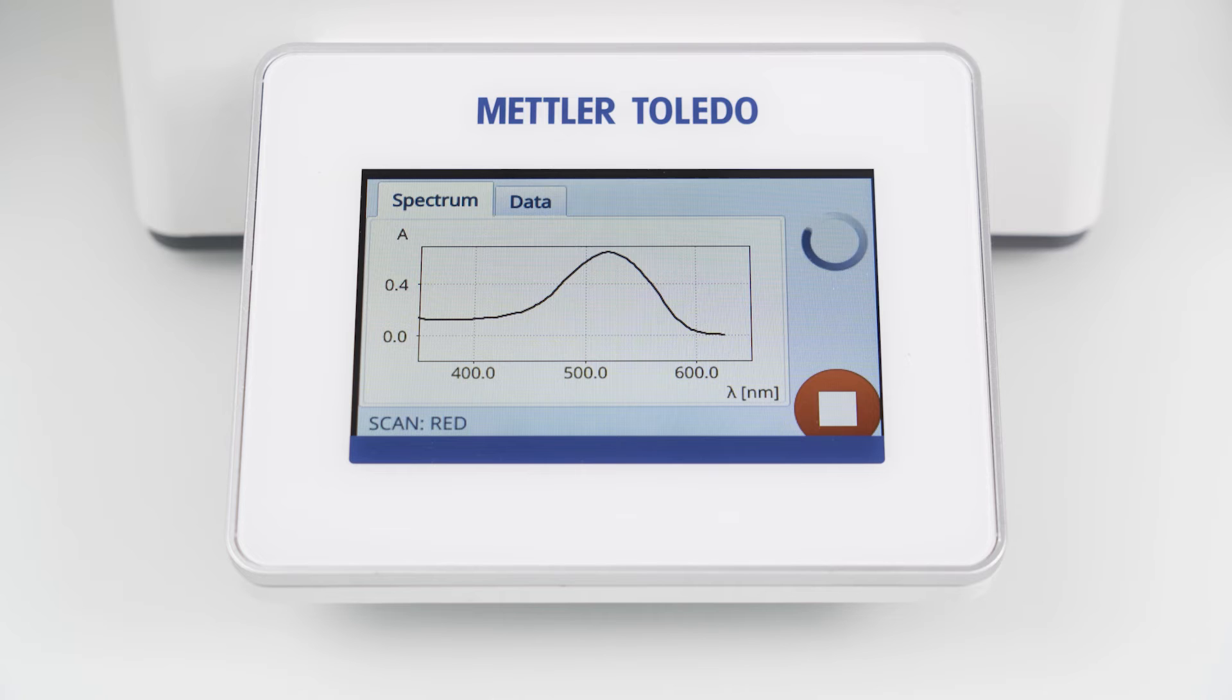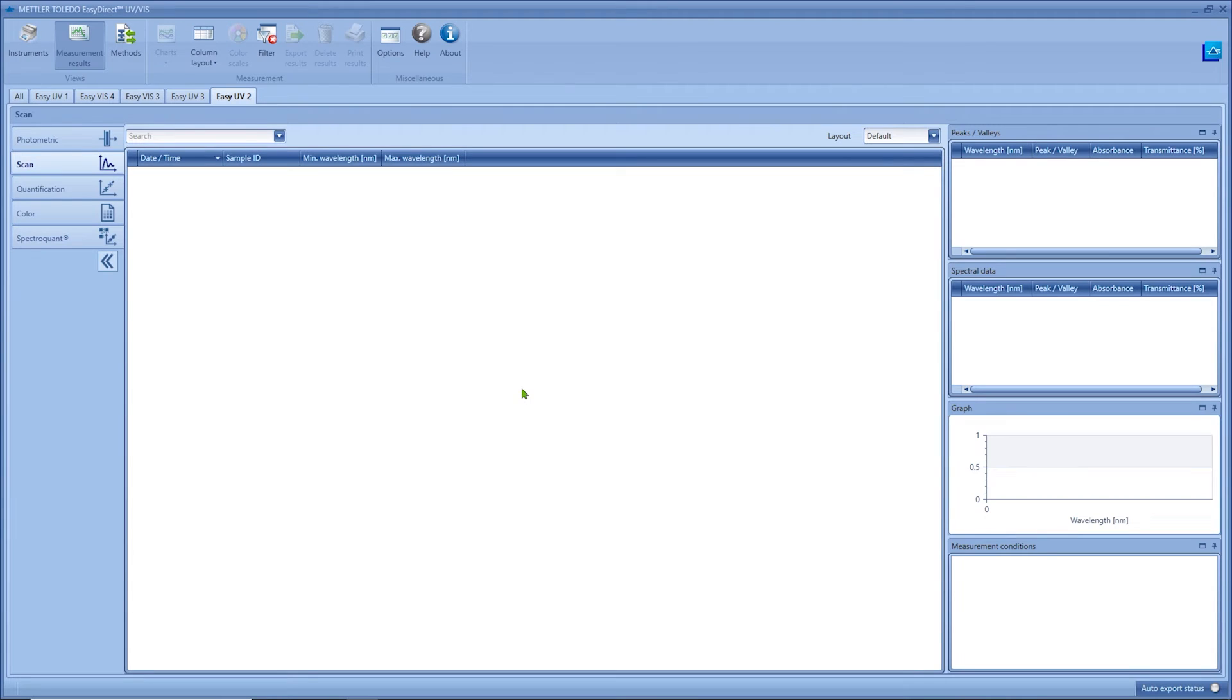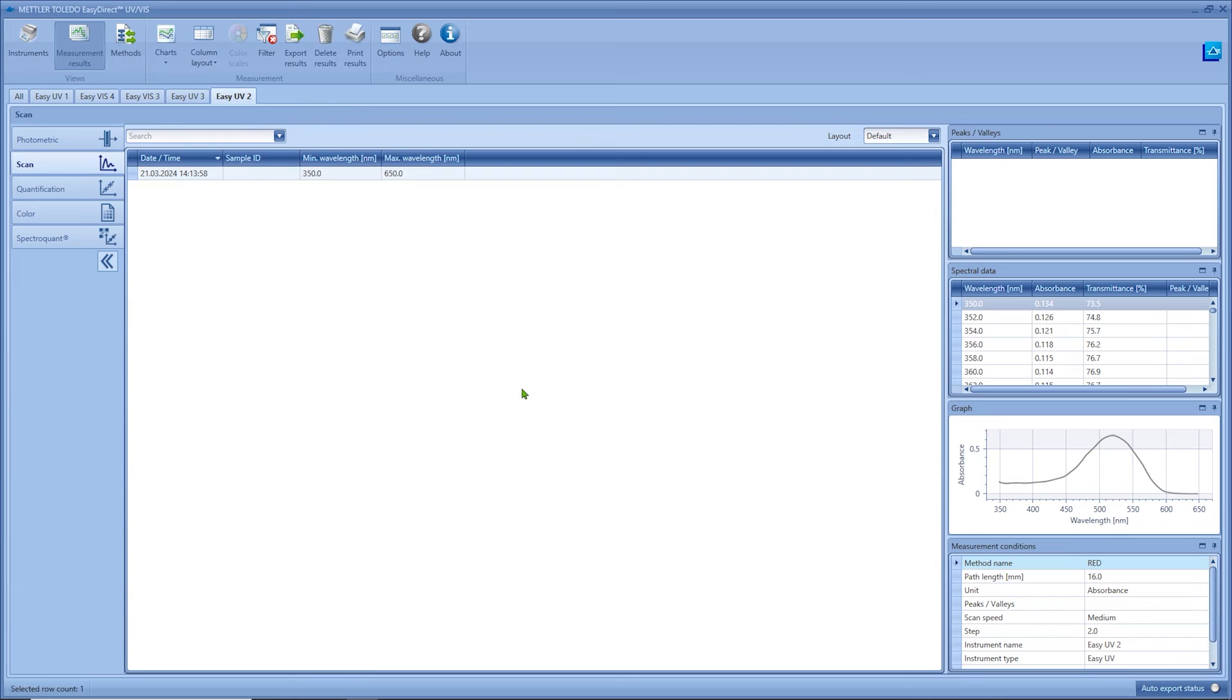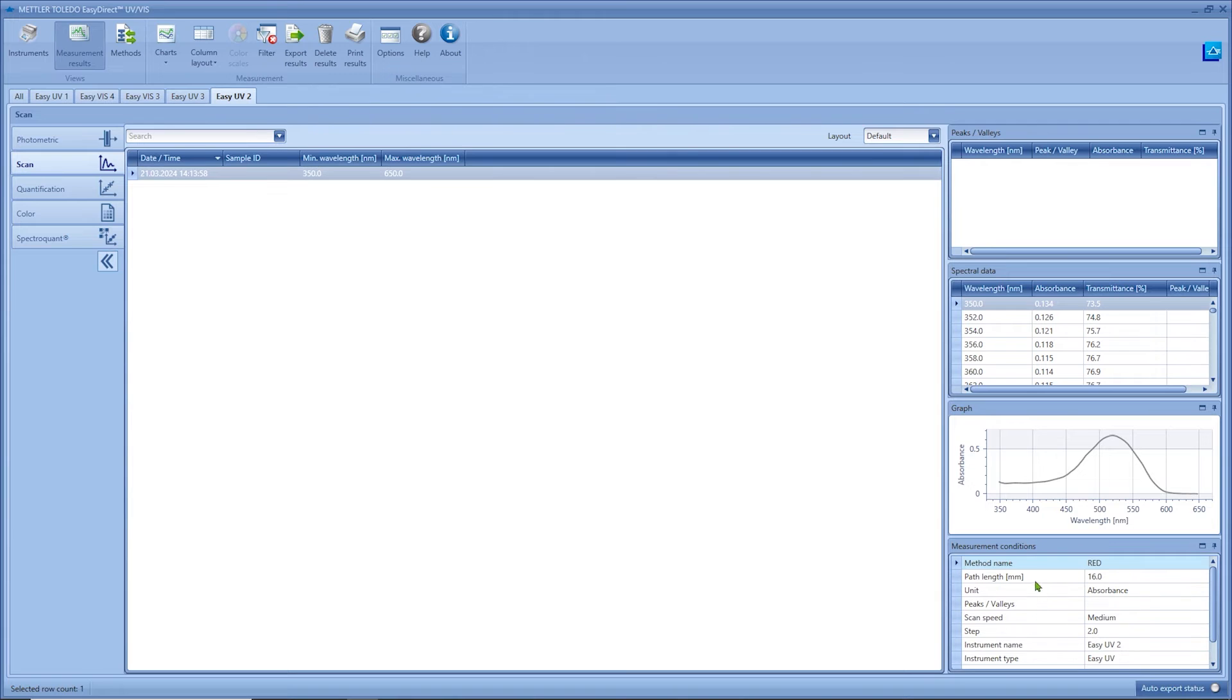As soon as the spectrum scan is finished we can find new entry in the result lists of the EZ Direct UV-VIS PC software. If we select the measurement category scan we can find our result and on the right hand side a list of peaks and valleys, the spectrum itself and some additional information.